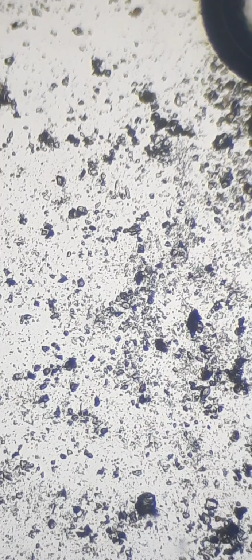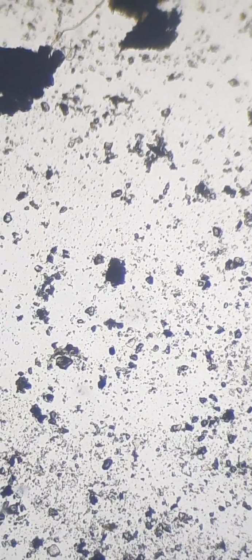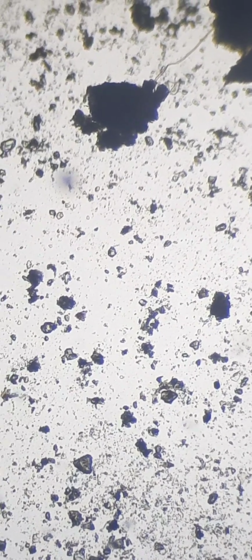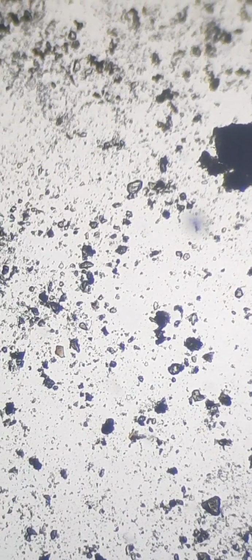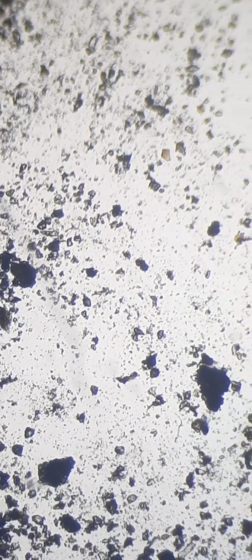In order to best record our data, we increase the number of slides and decrease the soil concentration on each in order to minimize the amount of microorganisms to best suit our counting method. We scan the slide in a grid-like fashion, going slowly and counting every organism that we came across. If there are too many organisms to count accurately, or if they're going too fast and swimming between grid cells while counting, the slide is reset and we start over.